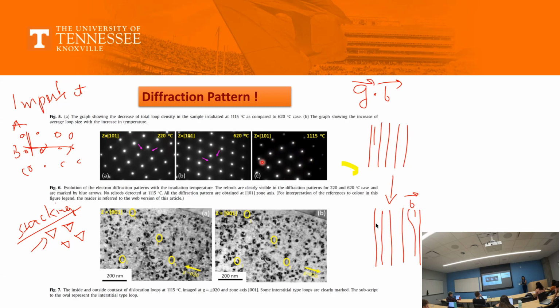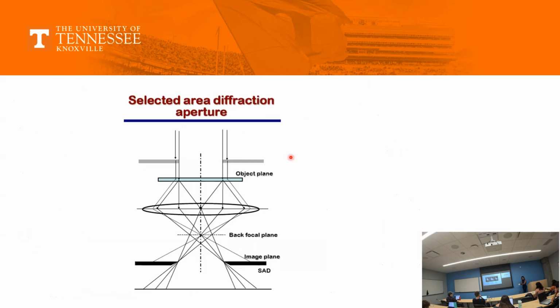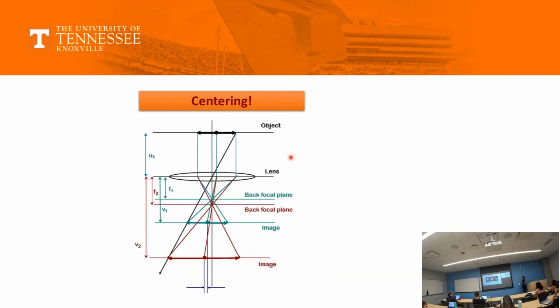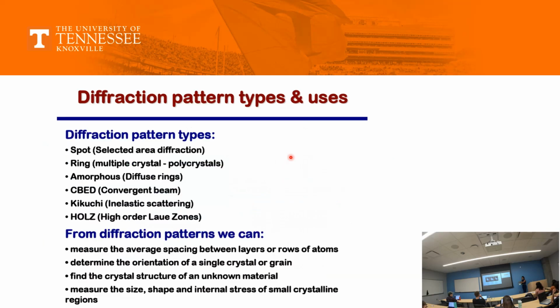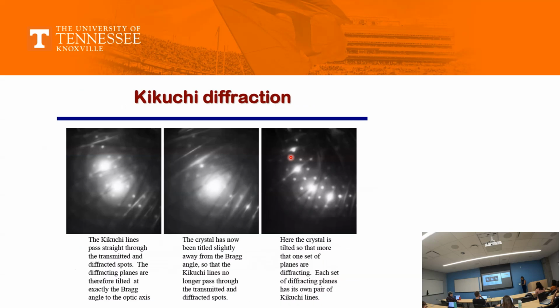But apart from the zone axis, if you start moving a little bit to the sides, you will have your secondary beam spots. Let me go through an example here. It is very important for me to correlate this very quickly. This is something that you see here. I would introduce it, but you would also benefit now.